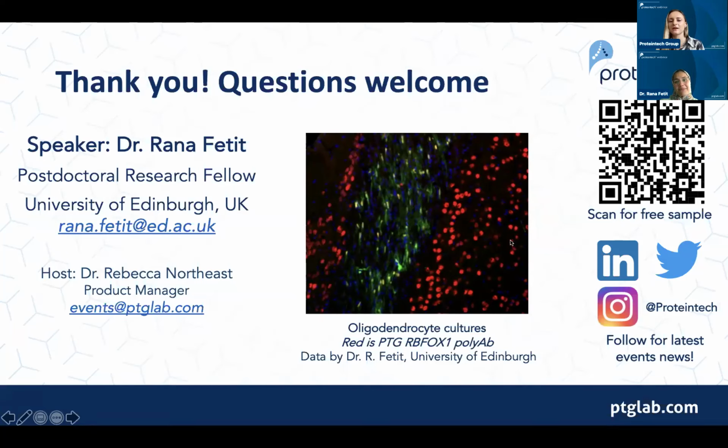And then there's another question asking, have you ever tried to reach a mature OL stage, such as MBP, MOG, in 2D culture? In 2D culture, no, they would not really produce a lot of myelin on their own in the culture. When you transplant them into the chimeras, for example, yes, you would see the expression of MBP and more mature markers, because they have a better niche, a better environment to mature. But in 2D in vitro cultures, they lack the essential cues to go towards that mature step. They would express markers like O4 and OLIG2, but they wouldn't go as far as producing myelin or becoming super mature in that sense.